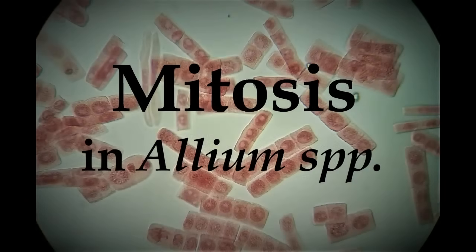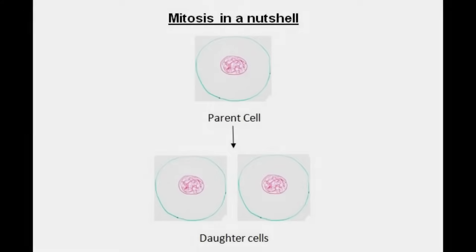In this video we'll be preparing root tips of allium species to observe cells in various stages of mitotic division. Mitosis is one of the stages in the cell cycle where the chromosomes of a cell replicate and separate to eventually form two genetically identical cells. Unlike in meiosis, chromosome number is maintained in both daughter cells.